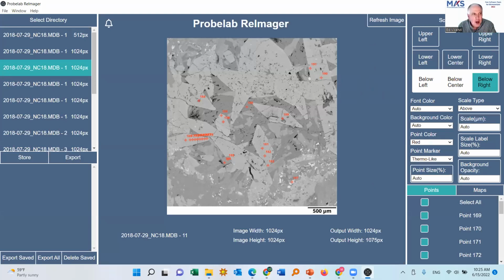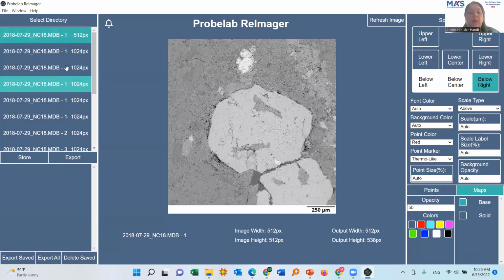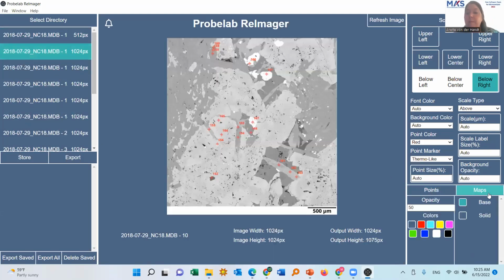Yeah. Are there filters for averaging or smoothing the X-ray images? Did I see that? So that is available through the X-ray maps. In Pathfinder itself, there are all the different kinds of imaging filters.